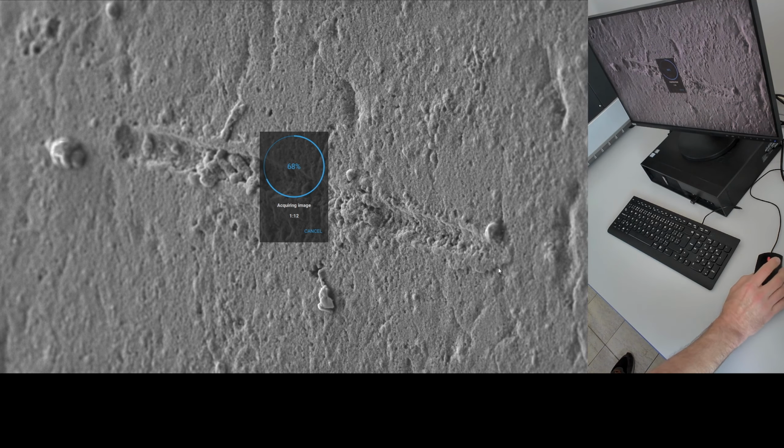Yeah, we've got the mid to near field in focus. I'll take this near field as well. Given the fact that this is not very deep here and it comes out and ends up here with something that's about the dimension of this, I think that is actually how this occurred. It came in here, and that would make logical sense that over here it was starting to destabilize and it was chucking out material.